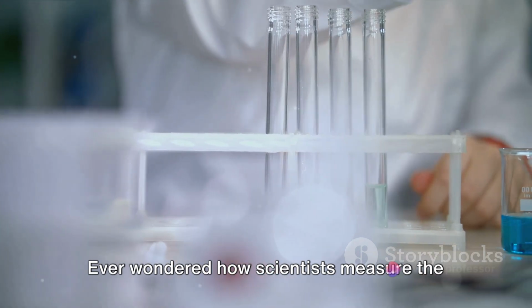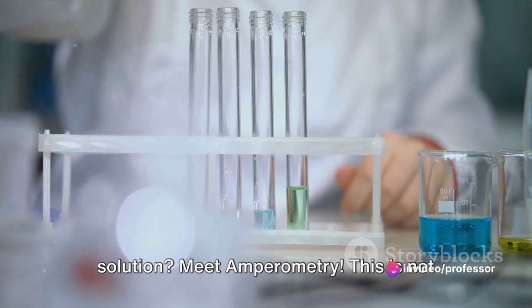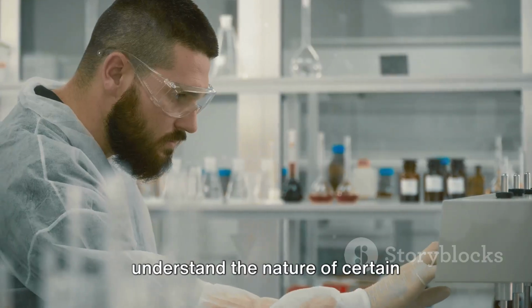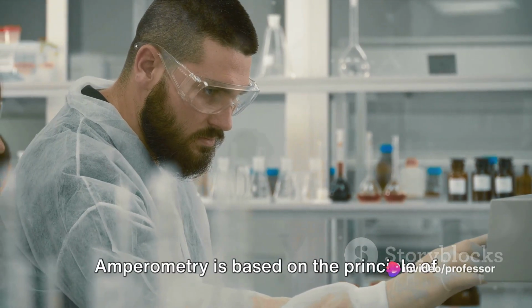Ever wondered how scientists measure the amount of a specific substance in a solution? Meet amperometry. This is not just a fancy word, but a powerful tool in analytical chemistry that helps us understand the nature of certain substances in solutions. So what's the magic behind it?